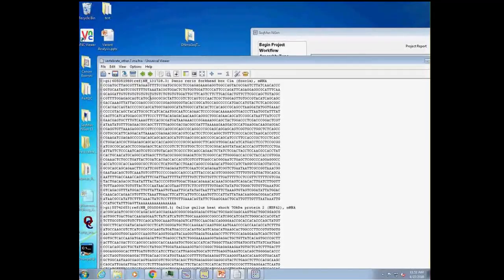In these FASTA files, the header contains the gene names. It's hard to find. It's way at the end, in parentheses. This FOXC1A is the gene name here. We also have the accession numbers for the mRNA sequences as well. So we have a little bit of information on the gene name and then some isoform information on those specific mRNA isoforms. When we do the annotation and get strong matches to one of these sequences, this is the information that's parsed out, and that includes the gene name.